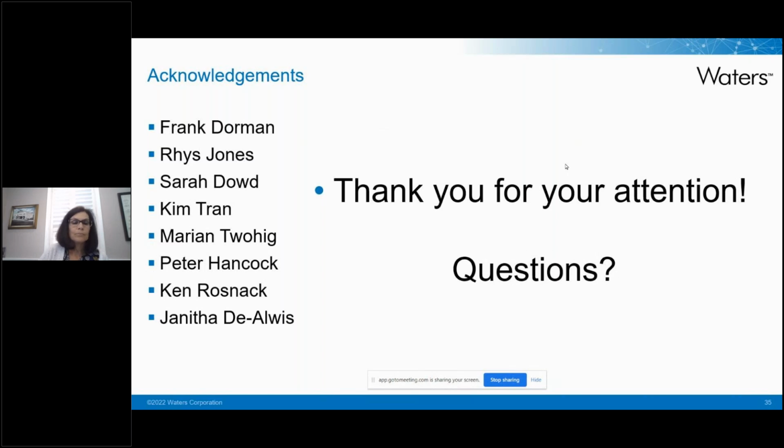Yeah, thanks, Jen, because I know we like to show the very nice sensitivity and linearity data, and the real fact of the matter is, though, as people go to these much lower parts per billion and parts per trillion types of analysis, you can run into specific problems because the solvent and the equipment that you thought was clean turns out to have background of specific analytes. And compounds like the PAHs and phthalates, as you might imagine, are some of the common culprits. One of the earlier adopters for the semi-volatiles analysis in particular did find as they went to lower levels, they couldn't get a blank for the compound phenanthrene, one of the PAHs.